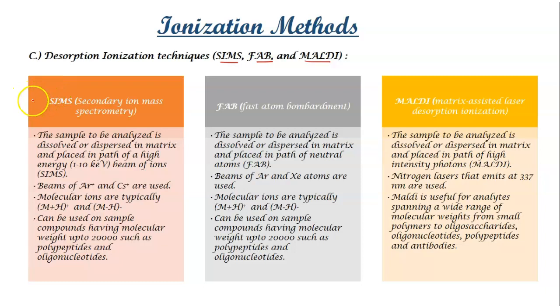Talking about SIMS first, that is secondary ion mass spectrometry. FAB stands for fast atom bombardment and MALDI stands for matrix assisted laser desorption ionization technique. So talking about all these three in detail.